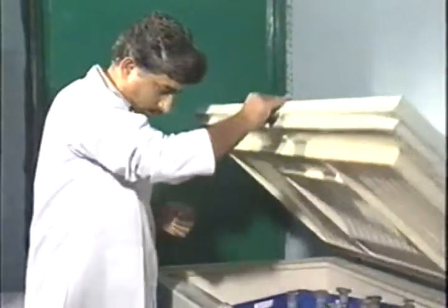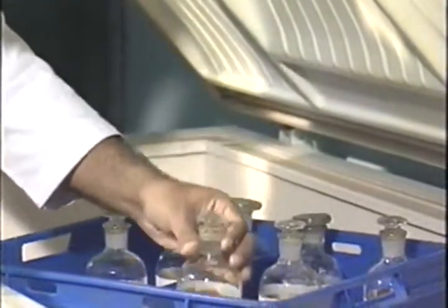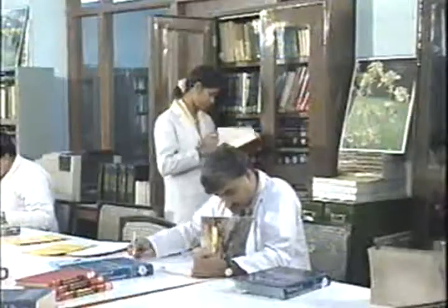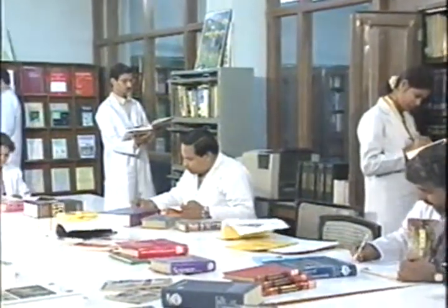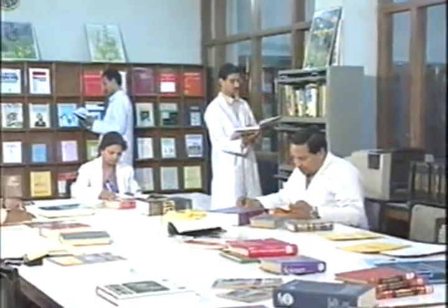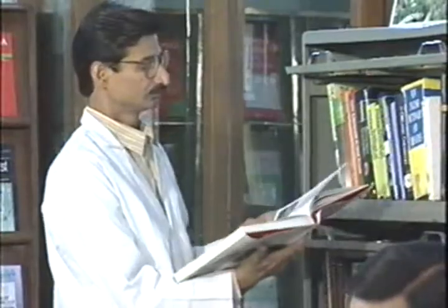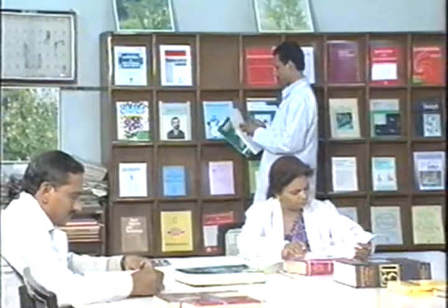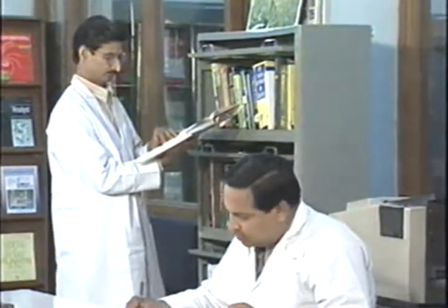The laboratory maintains a nosode bank where drugs prepared from pathogenic bacteria are stored at very low temperatures for the purpose of future reference studies. The laboratory also has a full-fledged library and documentation facility, providing a wide range of books, journals and periodicals in disciplines like botany, pharmacognosy, phytochemistry, homeopathy, pharmacology, microbiology, tissue culture and medicinal plants. Scientists and students from distant areas are regular visitors for consultation purposes.